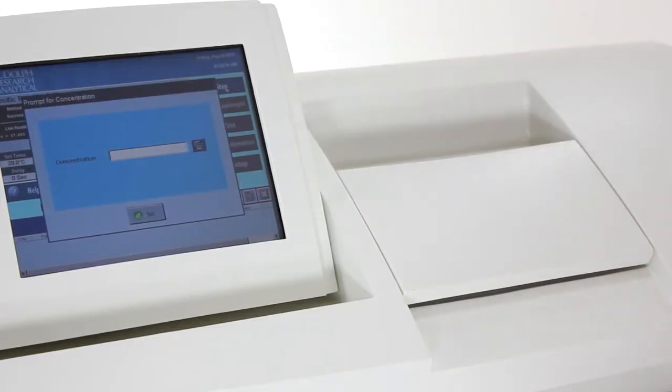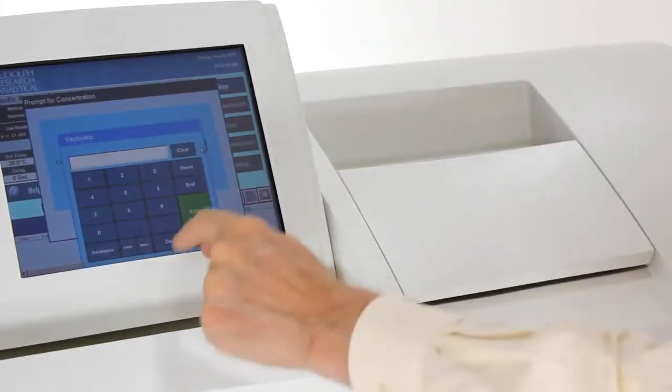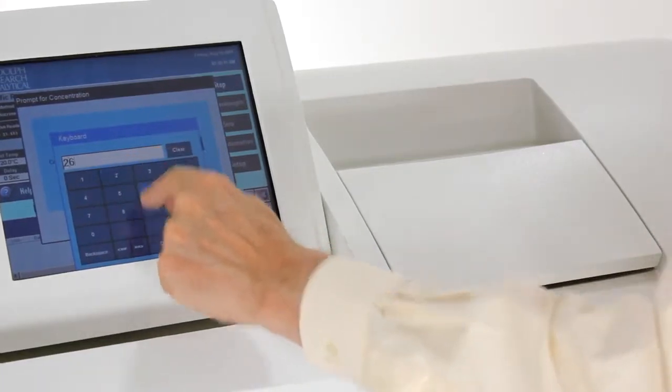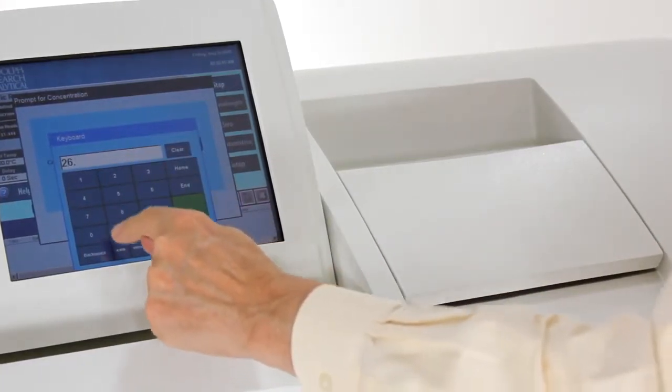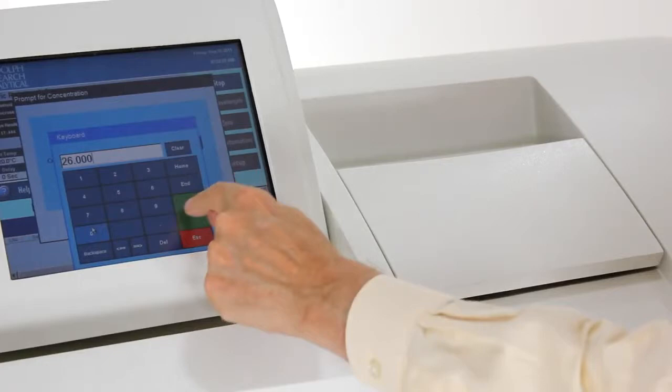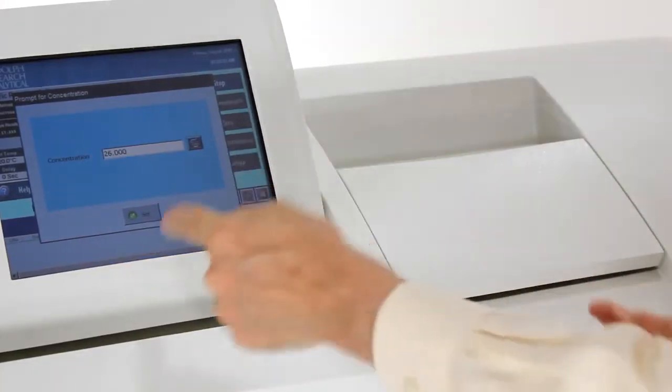The instrument is now going to ask me for the concentration. Key in the concentration that I've made the sample to. Press set.